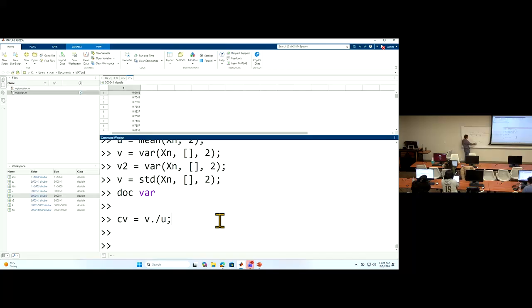Another gene, if it has a higher mean and a lower CV, will be here. If a gene has a lower average but a high CV, we'll put it here. So we will generate a scatter plot to look at the relationship between their average expression and their CV, to show the relationship of these two variables.